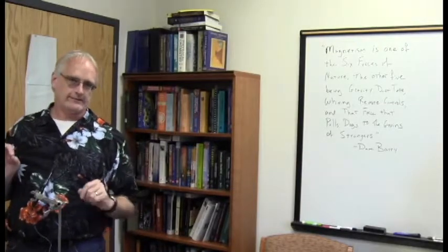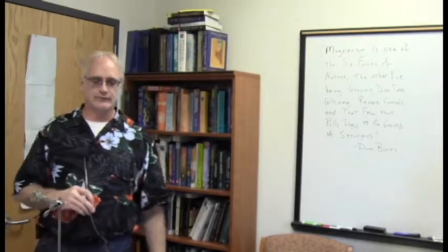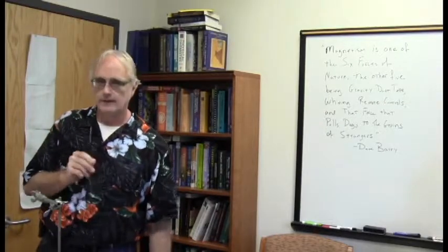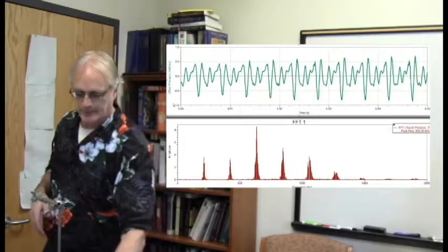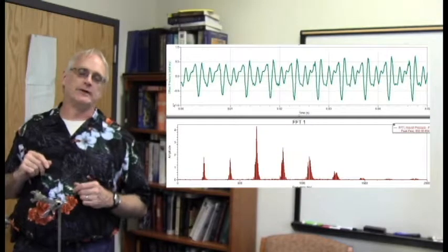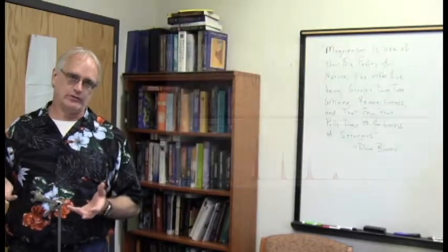And so as the last example of this, once again, the golden tones. Here are the frequencies that make up my singing voice. La la la. No, it's not one of the stellar singing voices, probably because it has quite a complex pile of frequencies in there. But that is how the Fourier transform gets used.